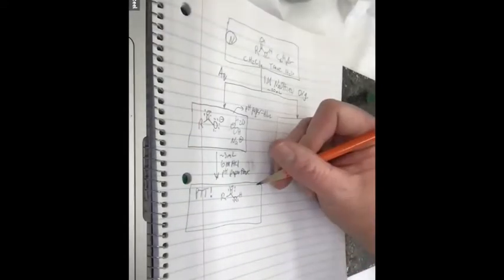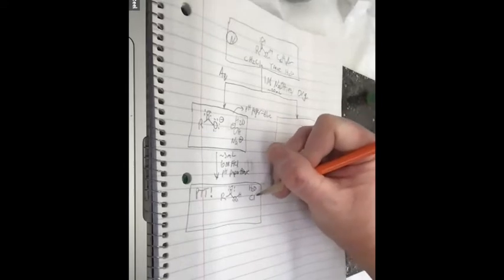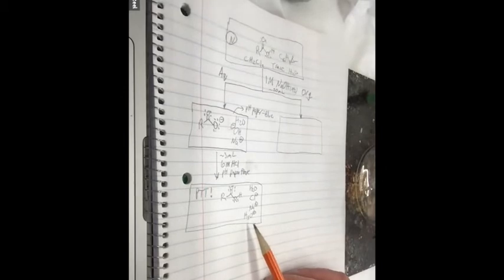What else is in this aqueous layer? Water and chloride and sodium and hydronium. Yes, because now it's acidic, so there is hydroxide, but the hydroxide concentration is so low. It's like 10 to the minus 13 or something, really low. So 1 times 10 to the minus 13 molar. So then we got that there.